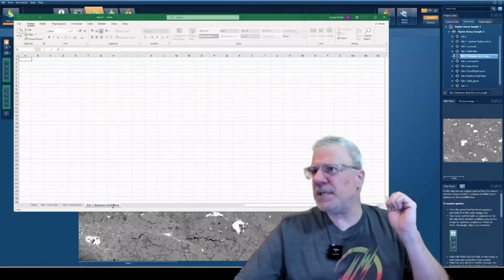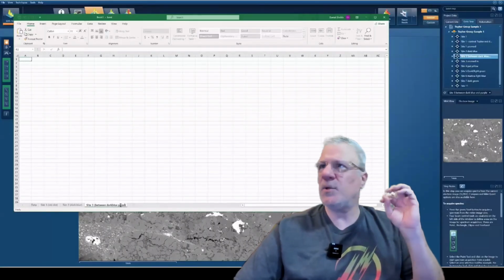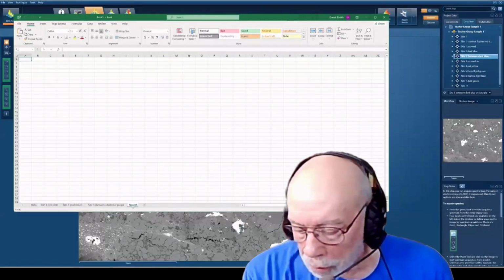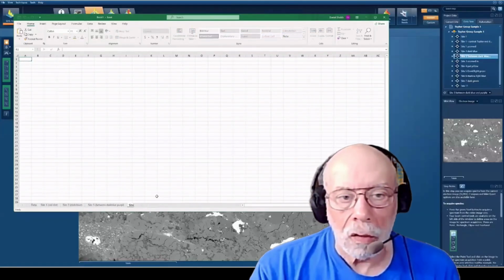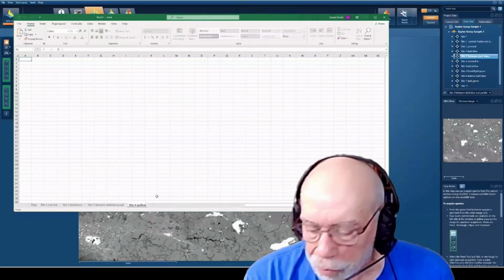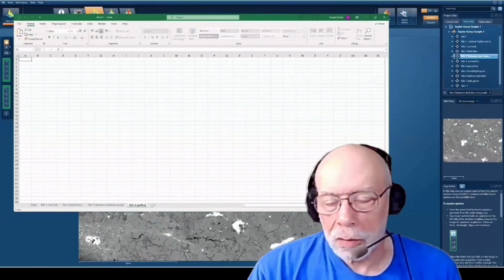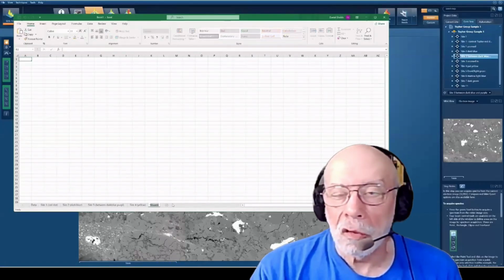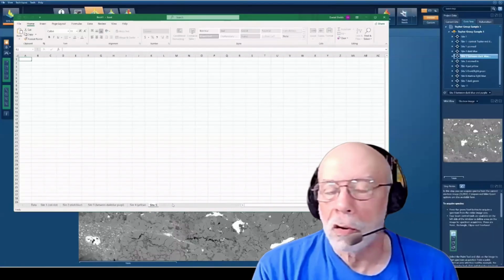We had a question in there. Maybe Cal, do you want to ask your percentage of oxides question? Yeah, I can do that. You had talked a bit about the total oxide percent adding up to 100, and you gave some reasons why it might be less. Is there a lower limit of what might make it acceptable or unacceptable?